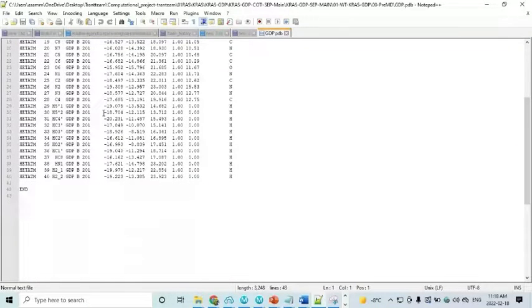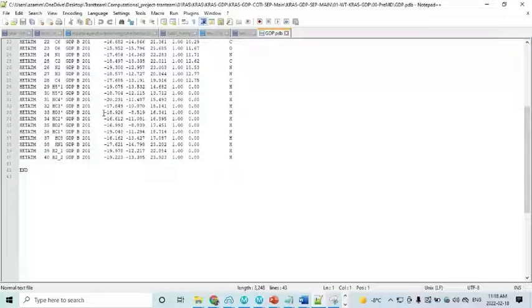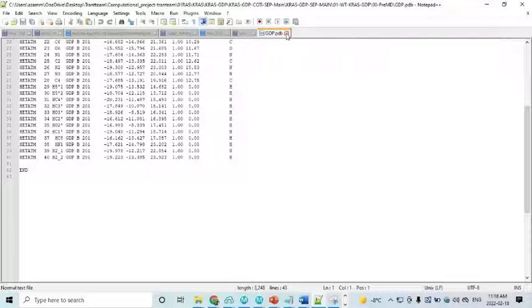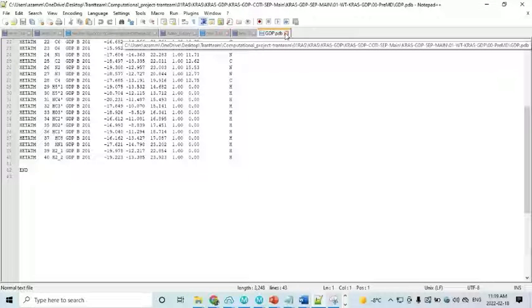You see, I cleaned all this unnecessary stuff, because these proteins have a ligand named GDP and a specific non-standard residue, the protonated serine. So we need to prepare or parameterize them so that the force field could recognize them as residues, and we could run an MD simulation and simulate these residues, because this is an important part.